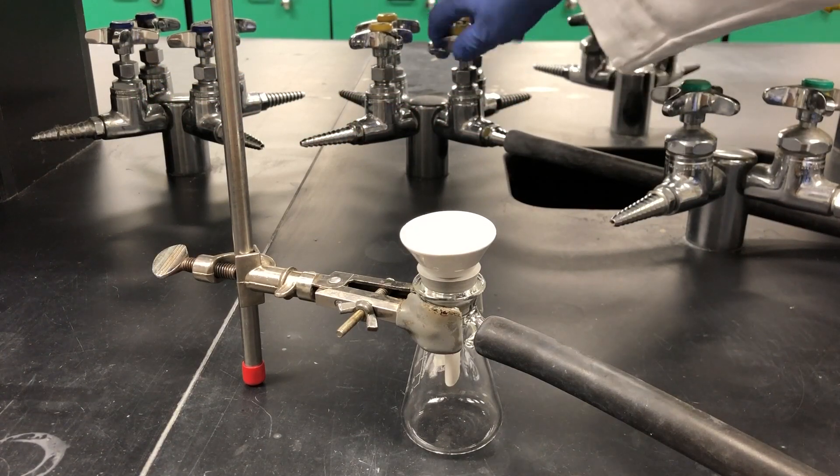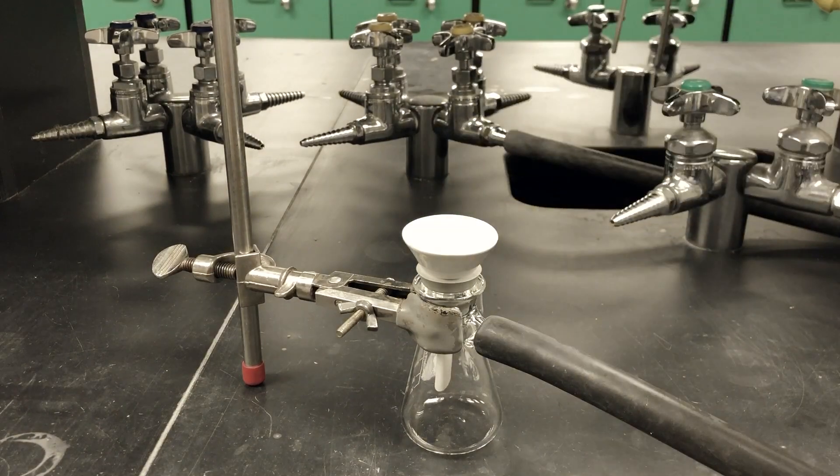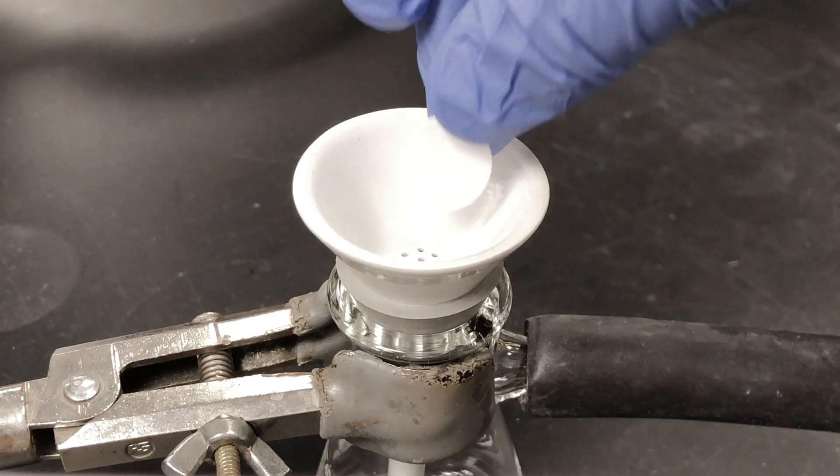You are now ready to start the vacuum filtration process. Turn on the vacuum tap and check your setup to make sure everything is airtight. Now place your 1.5 cm filter paper in the Hirsch funnel.